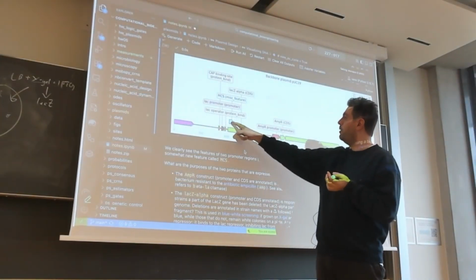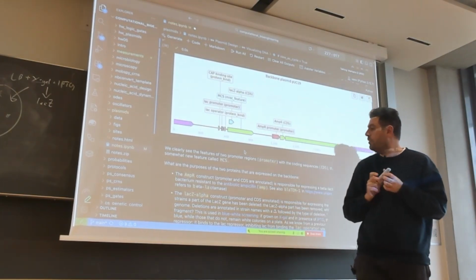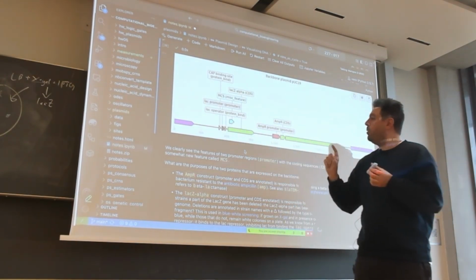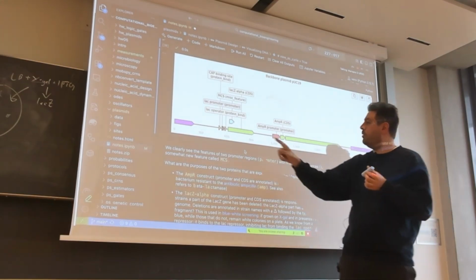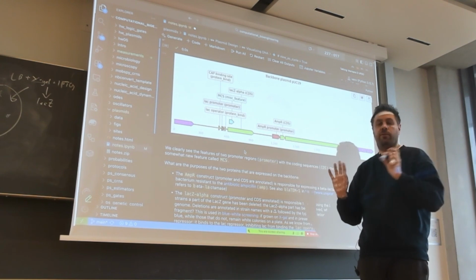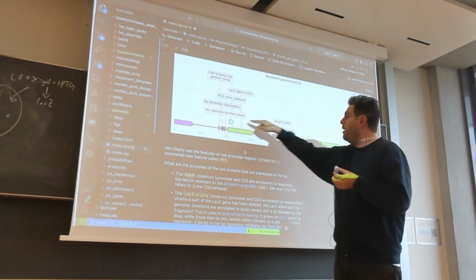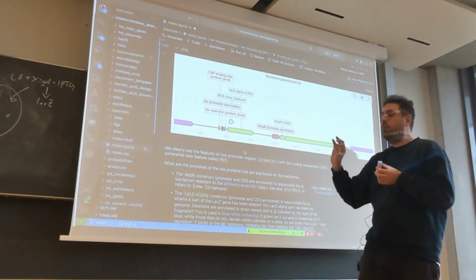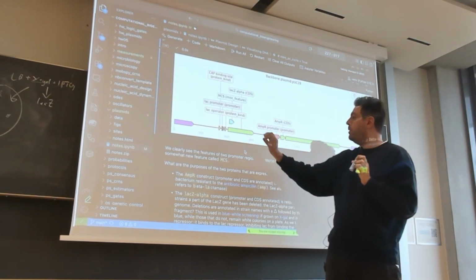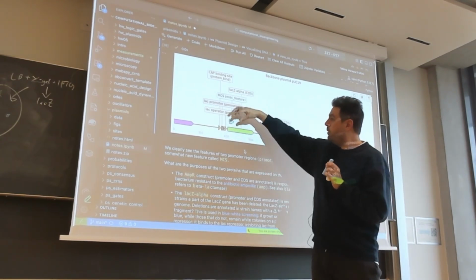And the magic is this thing here. The magic is actually there is a sequence, MCS. Yeah? This is a so-called multiple cloning site sequence. And this is a little sequence that the plasmid designers from University of California designed in a way that it's completely full of restriction enzyme sites. It's packed with such sites. We will see them concretely in a second. And they have the special property that they occur only once here and never outside. Yeah? So whatever restriction enzyme you use, you cut it open exactly once here and it doesn't touch anything else here. So it's particularly made to be inserted here, your construct later. Yeah? We will linearize it here and we will put our insert and our construct in here.